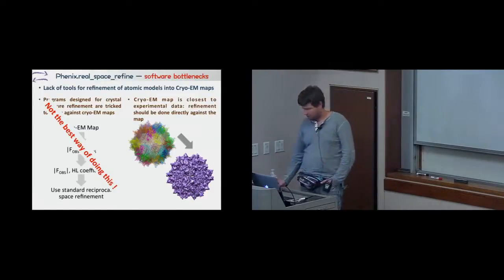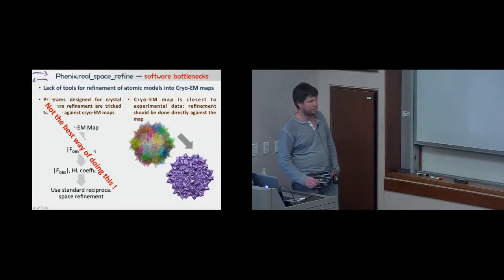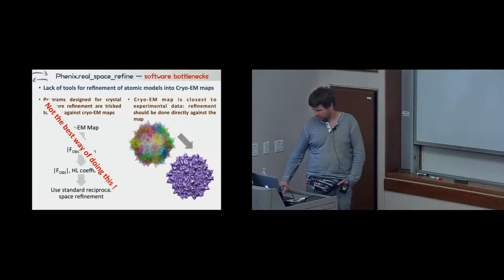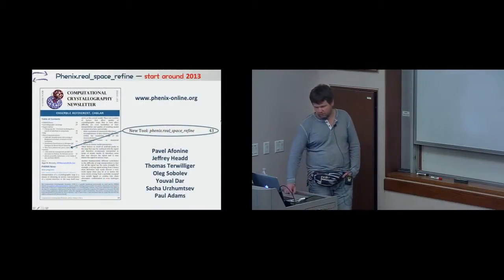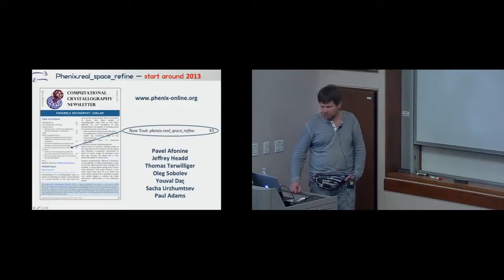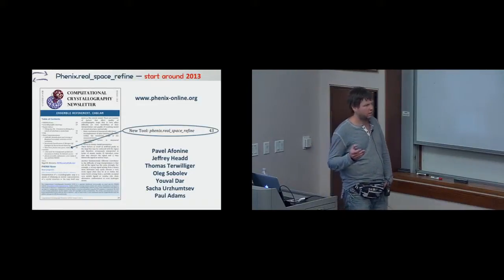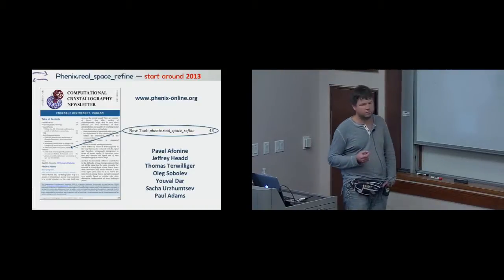That's the approach we adopted as our main development strategy for real space refinement in Phenix. Around 2013, we wrote a tool called Phenix Real Space Refine, where we documented the current state of the art and outlined our vision and future plans for the tool's development.